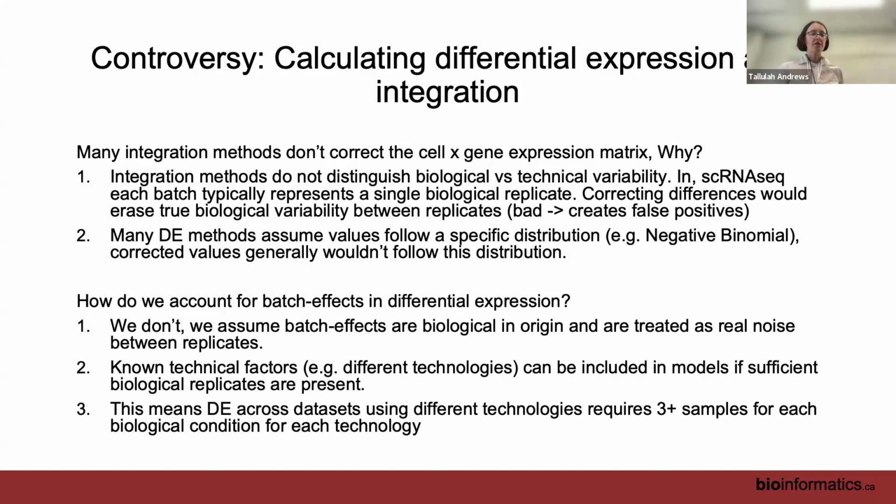So if you want to do differential expression across data sets using different technologies, you want to have at least 3 samples in each of your biological conditions in each of your technologies to do that reliably.